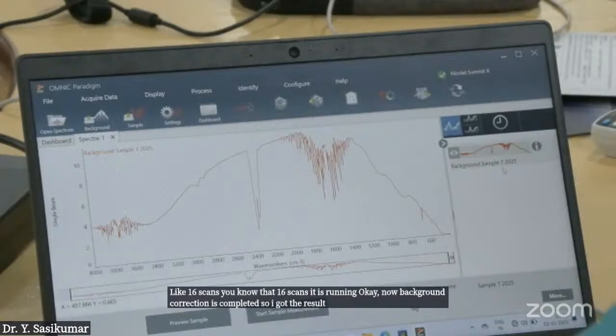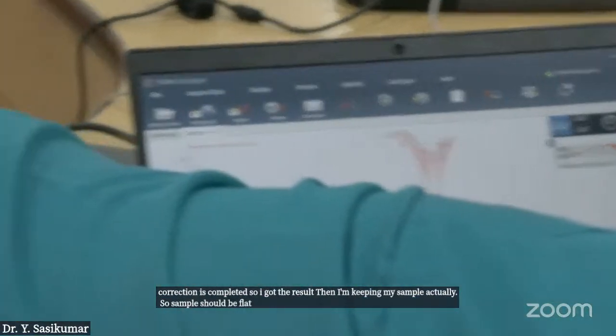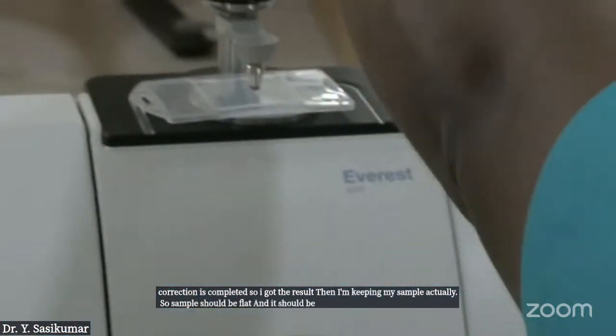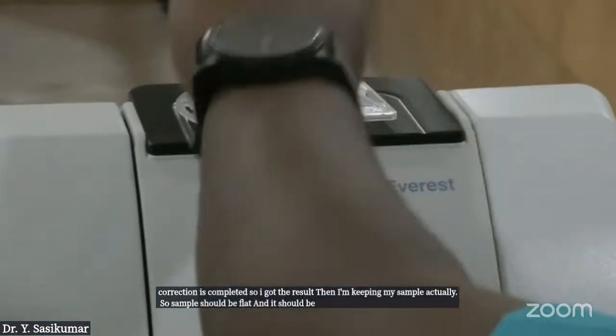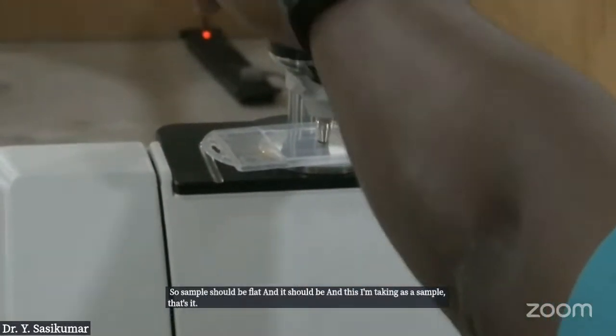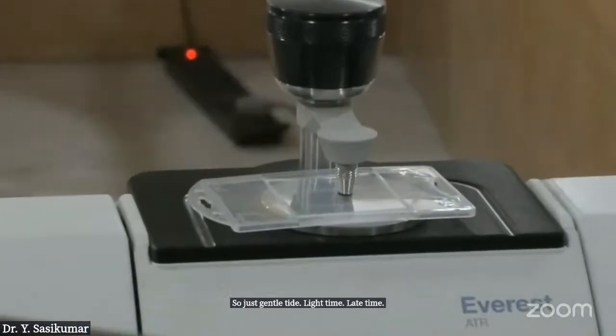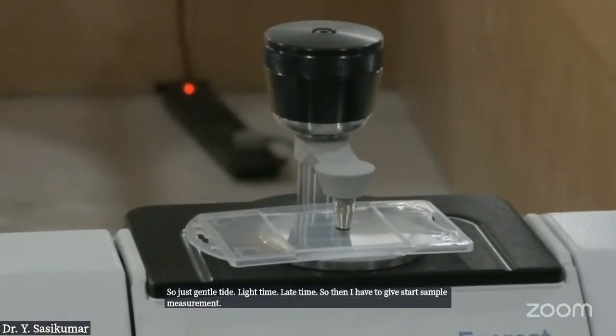Then I am keeping my sample. The sample should be flat. I'm taking a sample, that's it. Just gently tighten it. Okay, light tight. Then I have to give start sample measurement.